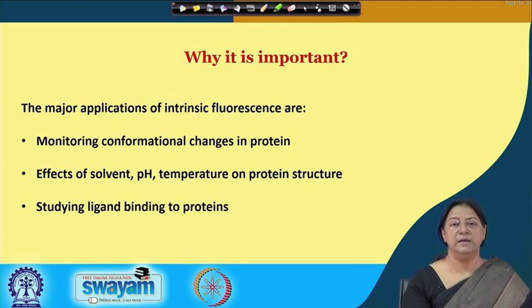And of course, ligand binding, which I just mentioned in the case of human serum albumin, where there is a single tryptophan that may interact with a molecule that is going to sit in the pocket where the tryptophan is located. What are we going to see in that case? We are going to see a reduction in the fluorescence intensity, a fluorescence quenching as it is called.